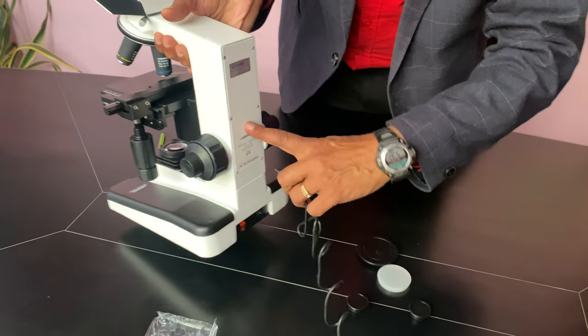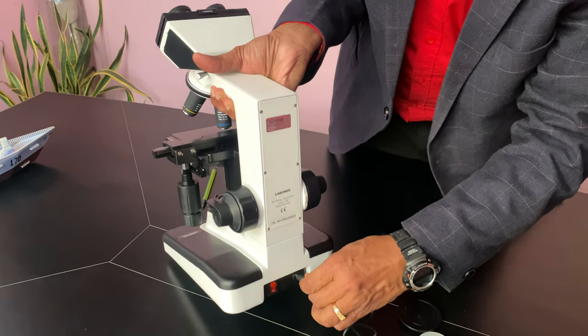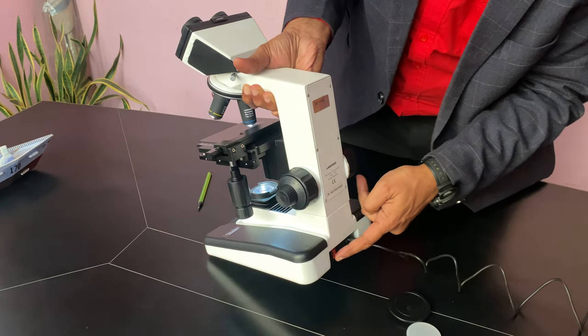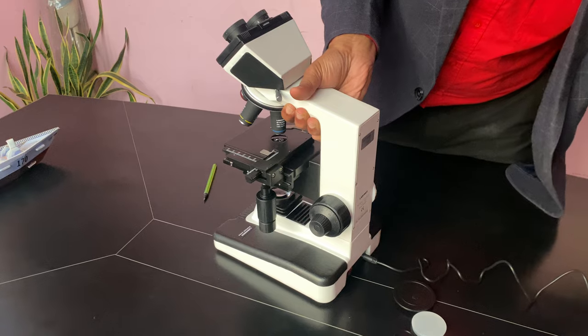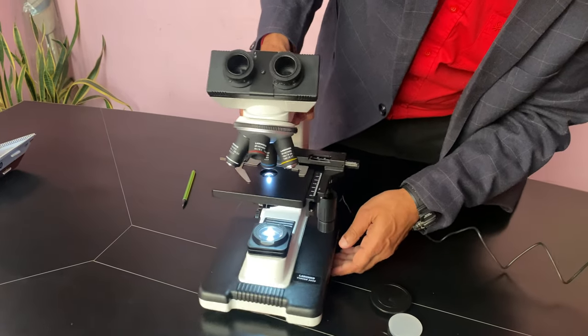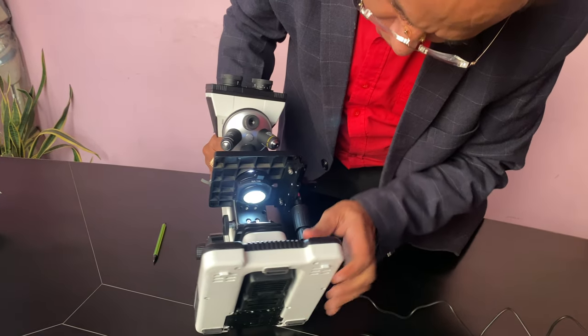On the back side, this model has a battery backup — this is an old model. An adapter is provided. When you connect the adapter and switch it on, the power will be there. This will give you the white light.